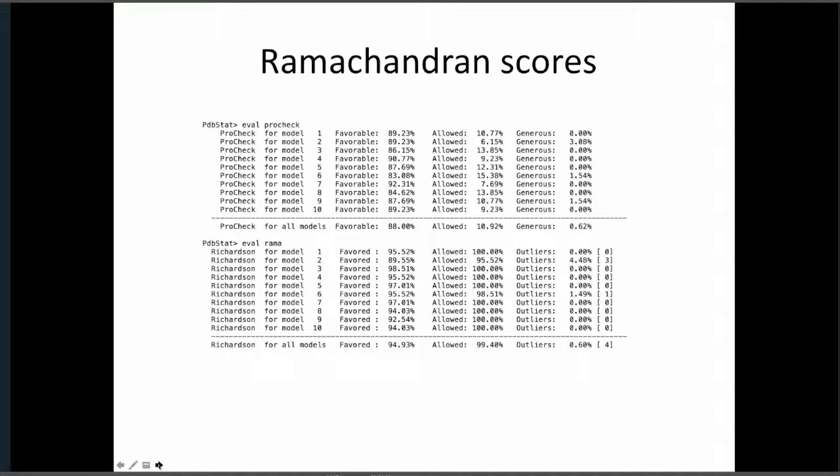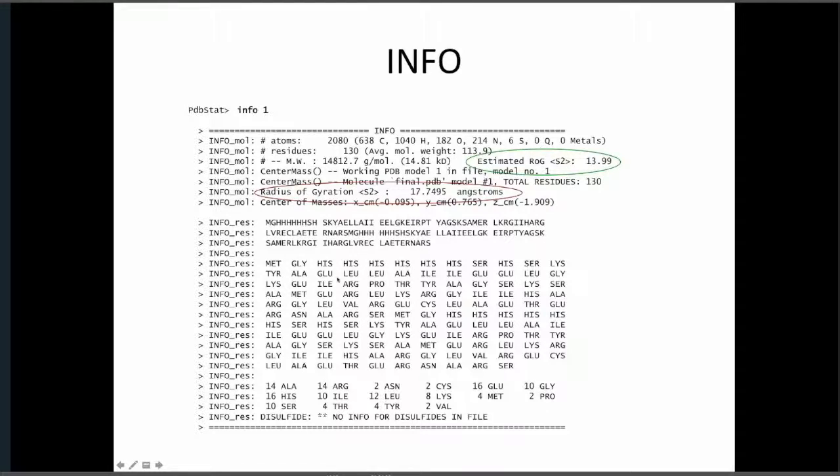As you see, most of these features come from friends asking at the lab for whatever they need on a day-to-day basis. Also, it will provide you some information about the models, just so that you're aware, like the number of atoms, the number of residues, molecular weight, the radius of gyration made out of the coordinates, and the so-called estimated radius of gyration, following a paper.